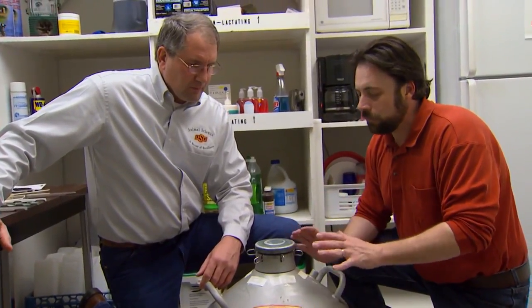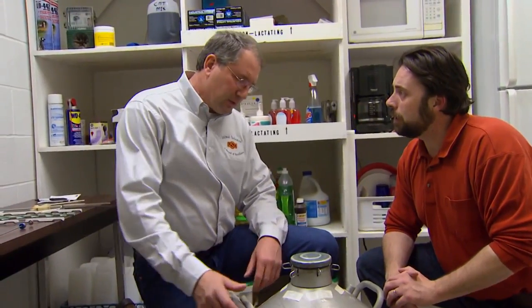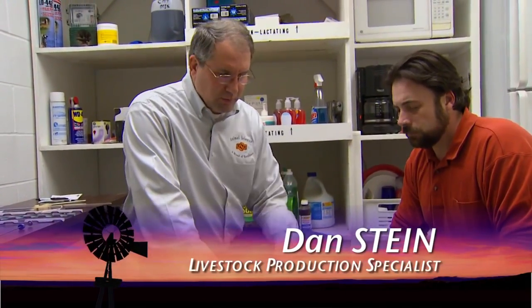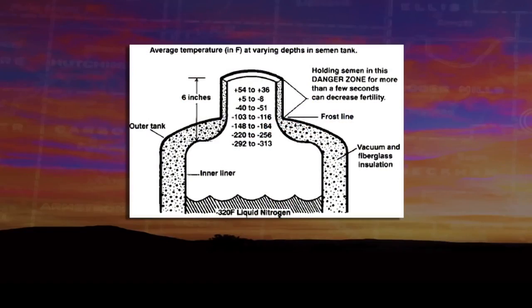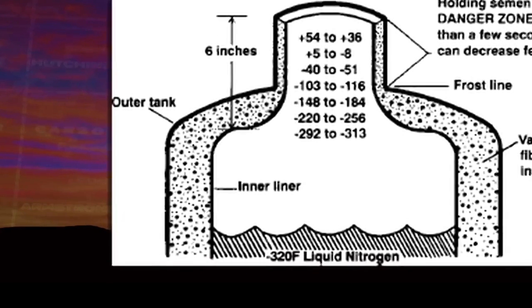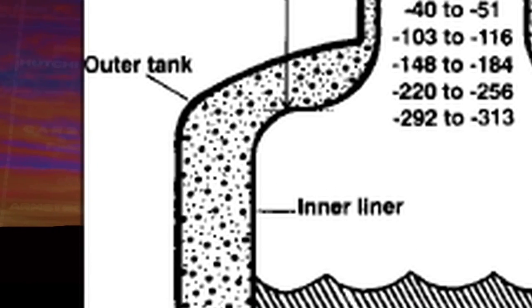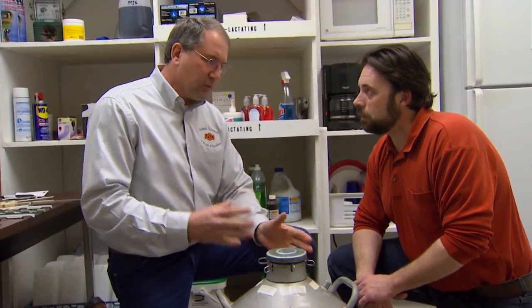Dan, first of all, what is this tank? It looks pretty robust, but you say it can also be very delicate at the same time. This is a liquid nitrogen tank that we use to store semen on the farm, and essentially all it is is a tank within a tank. Between the two is insulation and a vacuum seal to keep the nitrogen from evaporating. So again, this is one of the things that's overlooked as far as management of the semen tank, and management of the semen as far as handling, as far as loading the gun from the tank to the cow.